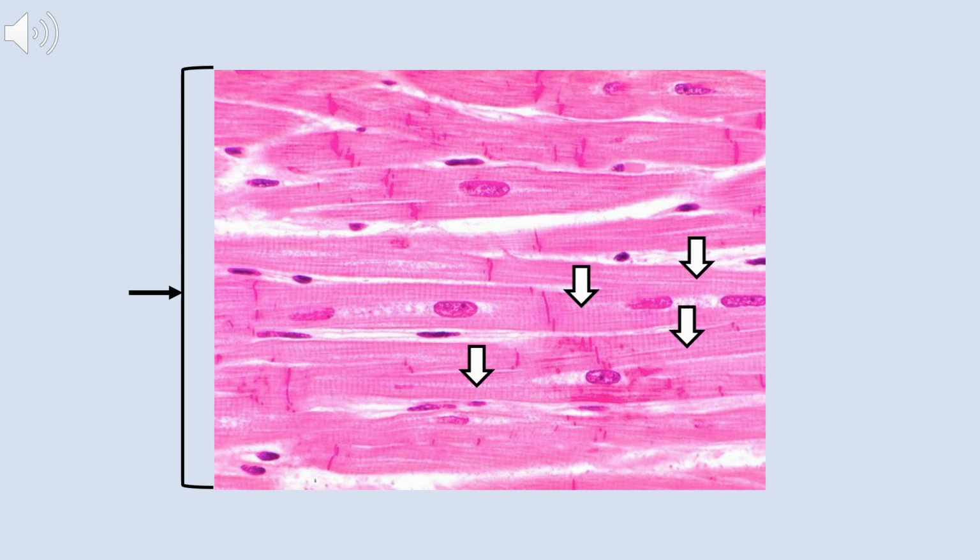All right, now striations leap right off the page at me as soon as I look at this. And so that indicates that I'm looking at one of two tissue types. It's going to be a primary type of muscle, and it can either be skeletal or cardiac muscle. Now I can tell the difference between skeletal or cardiac very easily in this slide. One, there's not multinucleate cells. The nuclei aren't crowded along a single line. The cells do seem to branch in Y shapes as opposed to being one long cylinder. And then the other obvious giveaway is that we have intercalated discs, which indicates that it can only be cardiac muscle.